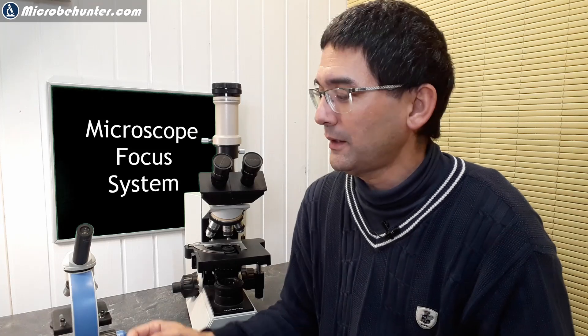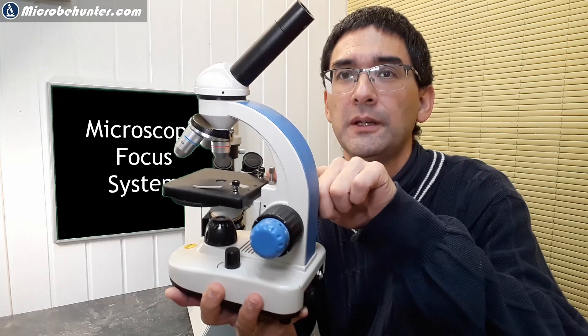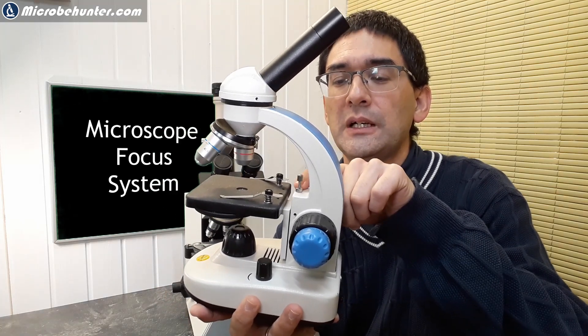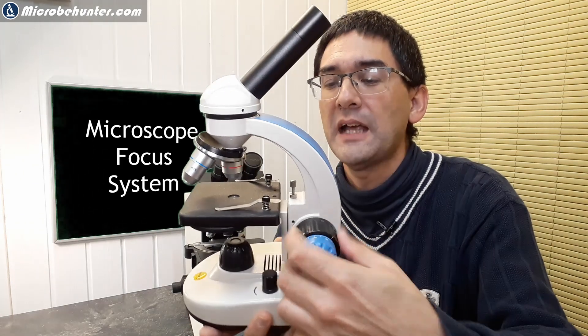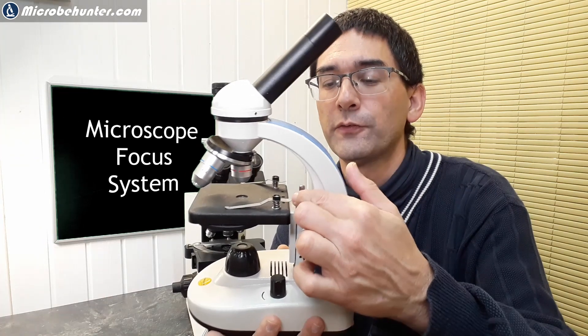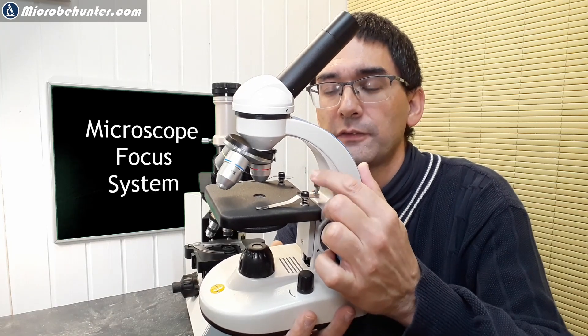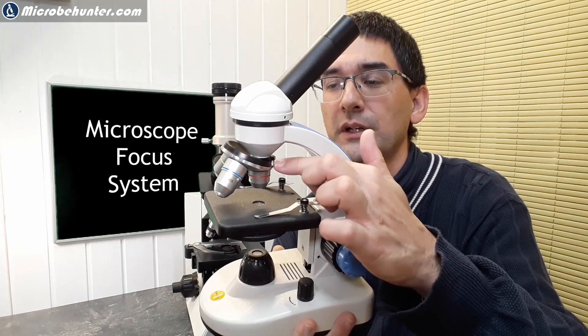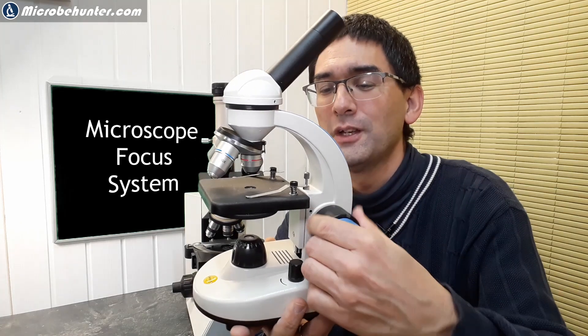Something many people don't know: check if your microscope has a little screw here. This one has one, and it allows you to set the highest position of the stage. If you go any higher, this screw will block it — it prevents the stage from being raised even further. This is a protective mechanism for the objectives. If you don't have the full focusing range, you may want to readjust this screw.